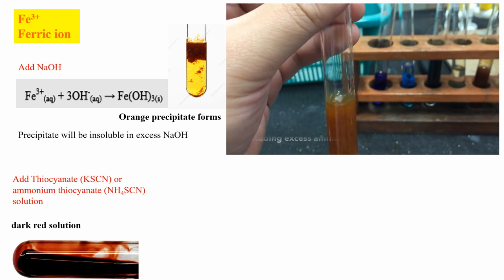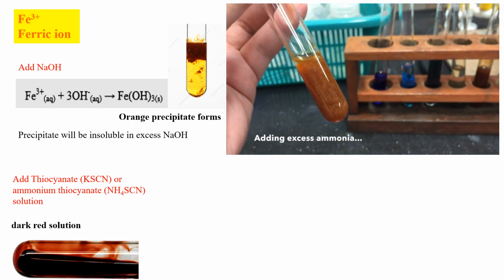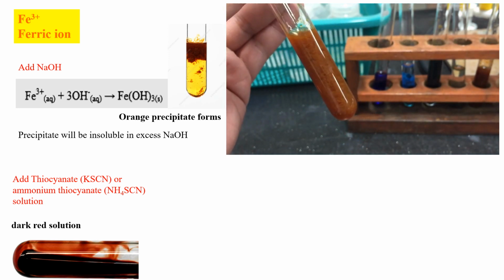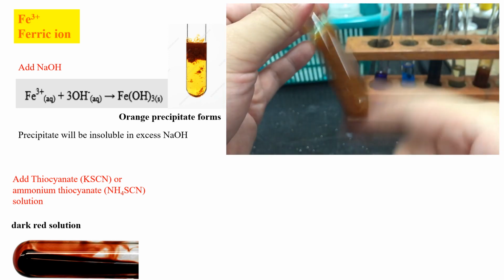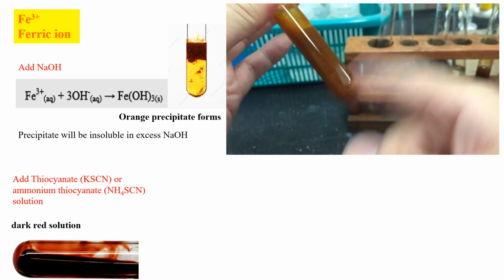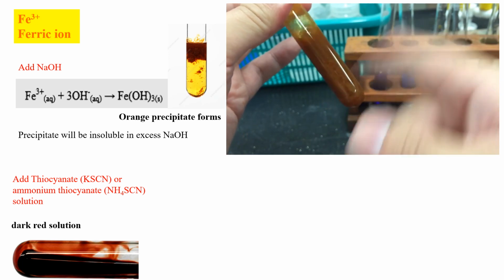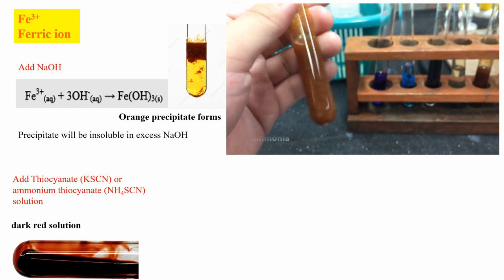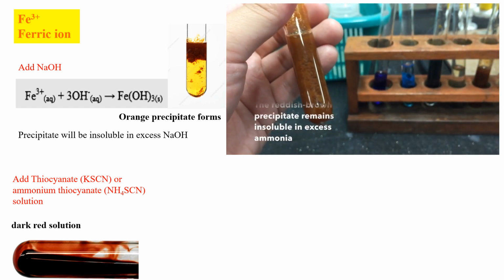Proceed to add an excess of ammonia solution into your test tube. Shake the test tube to ensure thorough mixing. Notice that the reddish-brown precipitate remains insoluble in excess ammonia.